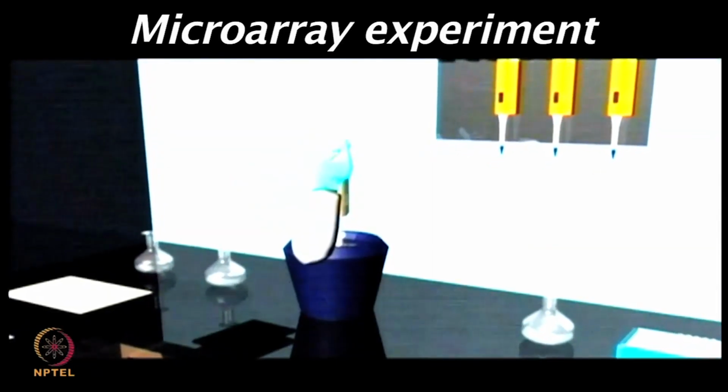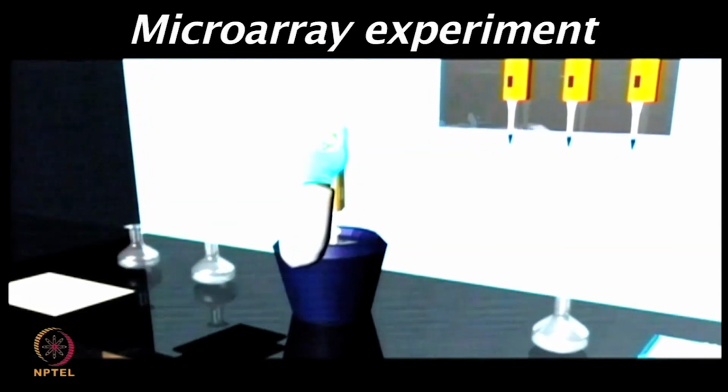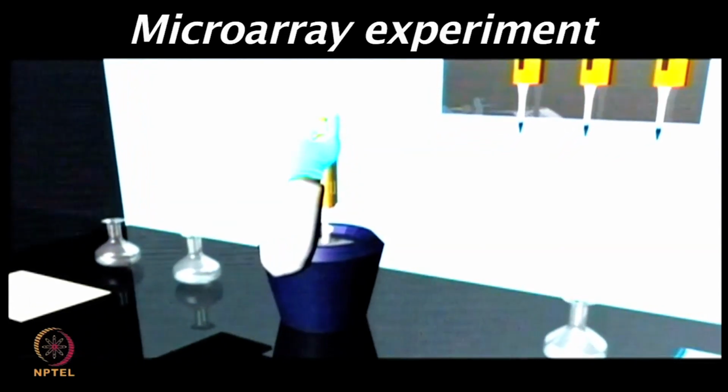After addition of the secondary antibody, the chip can be incubated for an hour.